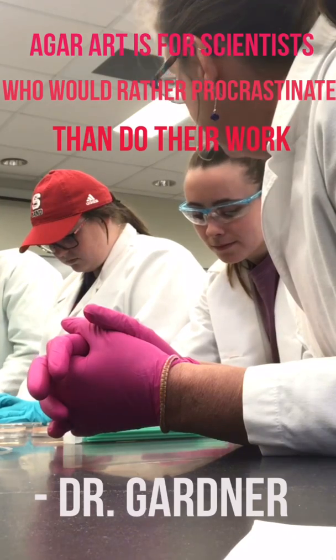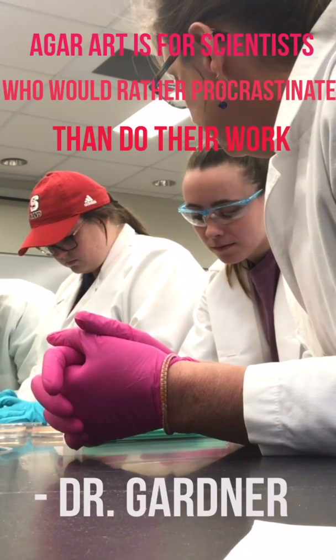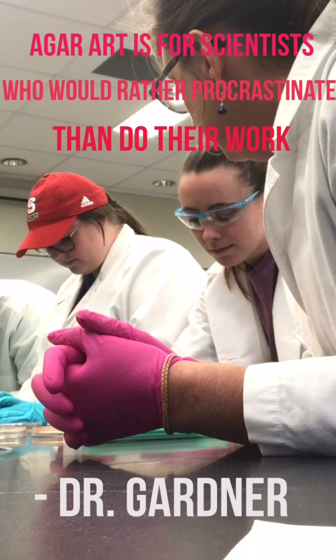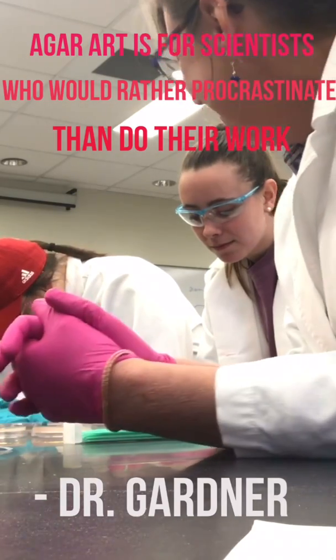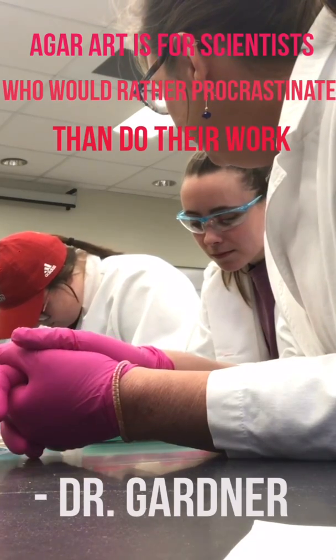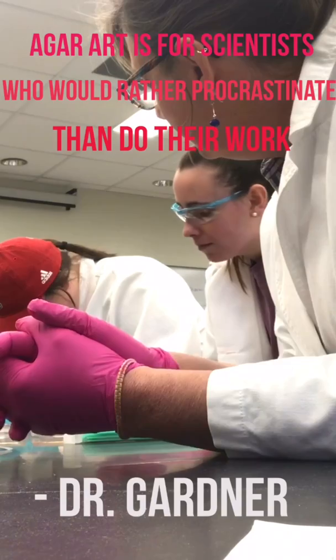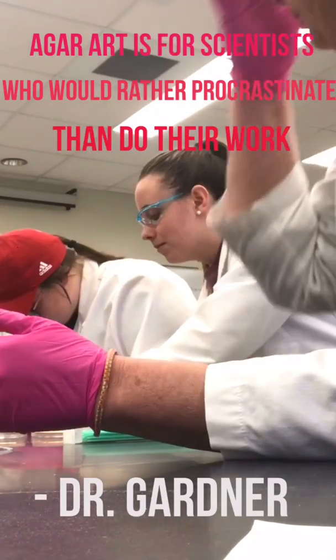See what I mean? Do we ever refresh on cells? Yeah, you refresh on cells. Wow, doing an 8 would be so hard to draw. Oh, jeez. See what I mean? When do we refresh on cells? When you feel like you should. When you can't see them. You can just grab as much as you want, Megan. Okay.